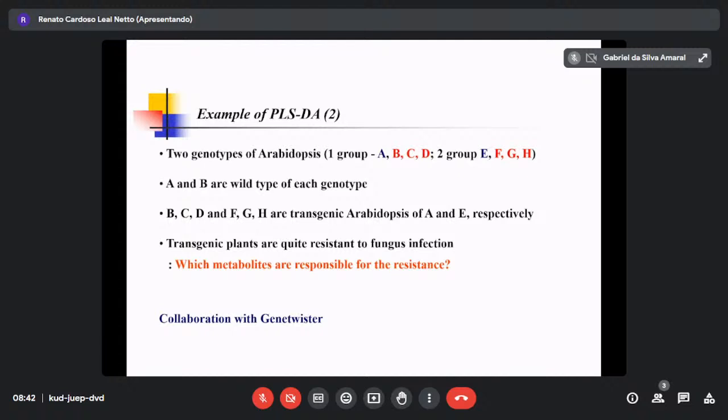But when you start the principal component analysis, you don't know which one will be shown in it. Why? Because principal component analysis is an unsupervised method. Yesterday I mentioned I brought my daughter and asked her to separate these.